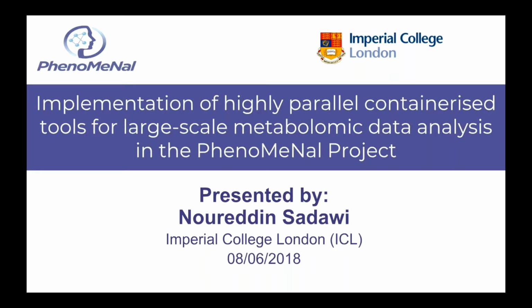The title says metabolomics data analysis, but what we're going to see today is something generic, so it can be anything really that you can do in your code, anything you can do using a Docker container, then you should be able to run it on Phenomenal, as we're going to see. So, straight to the talk.